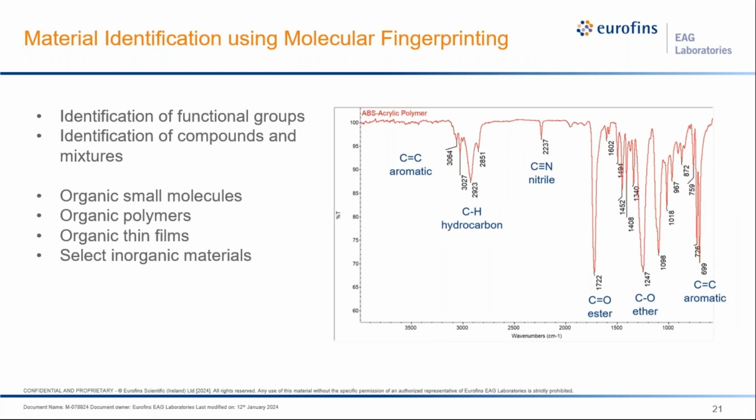So the principle behind identification is called molecular fingerprinting. The idea here is when we analyze the sample, typically we are irradiating it with some kind of light, and then we're getting a spectrum back. And this spectrum that we obtain has to do with the functional groups that are present in the material we're analyzing. So you can think of this as a fingerprint for all the species that are present.